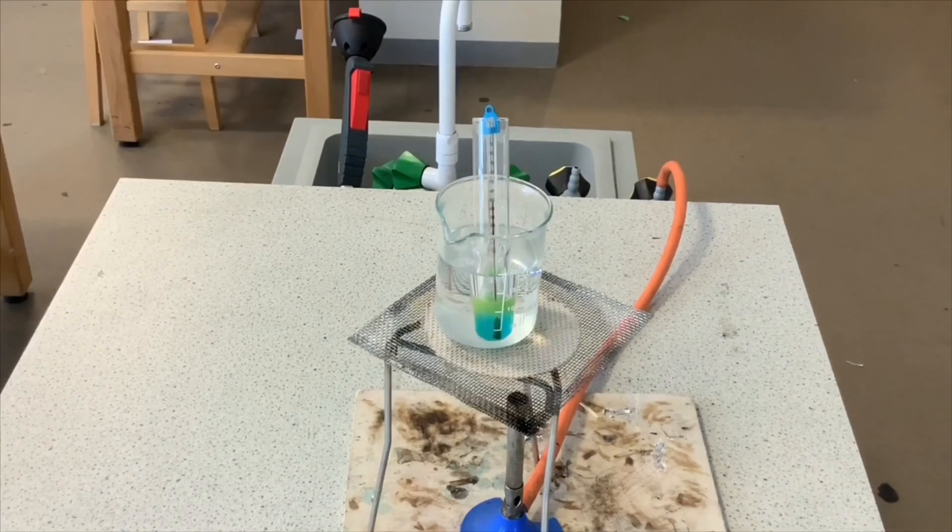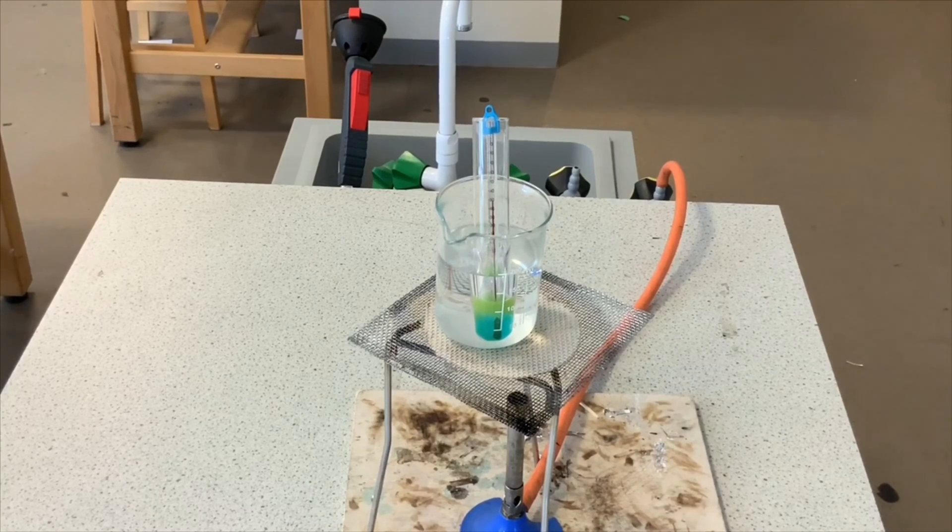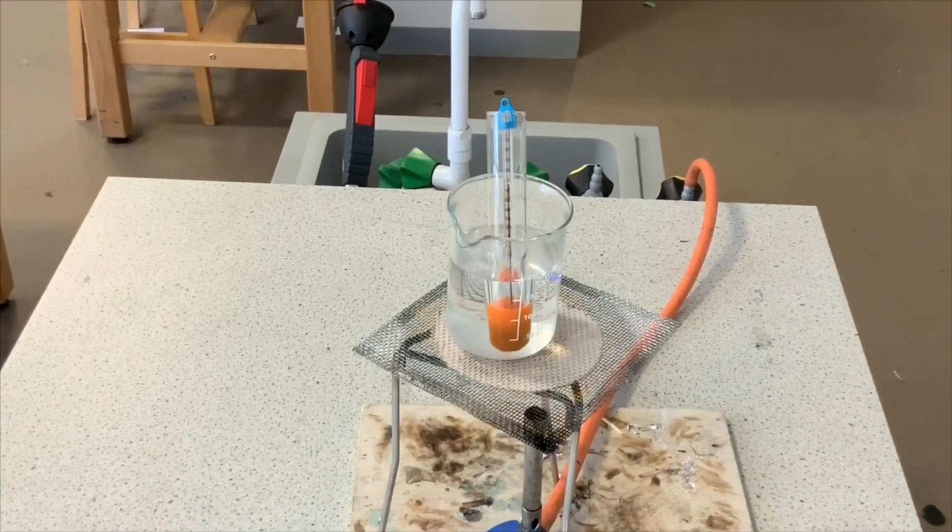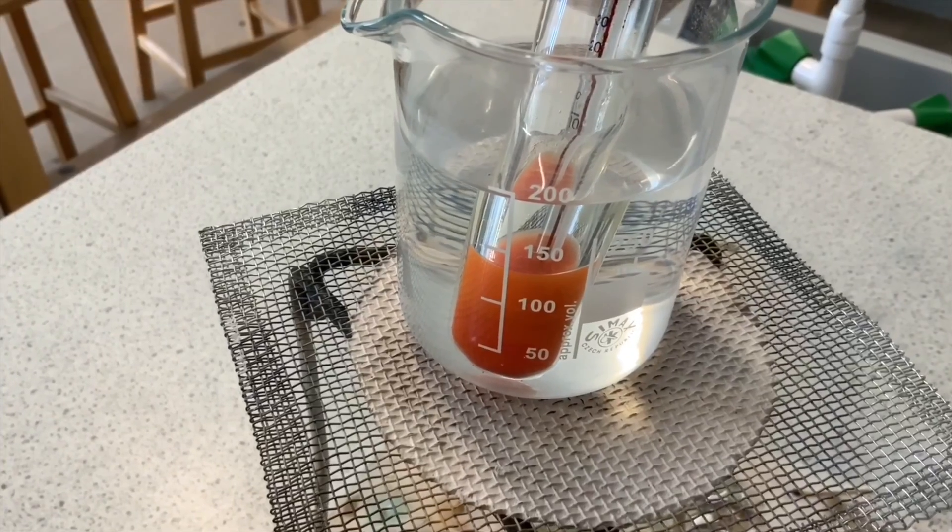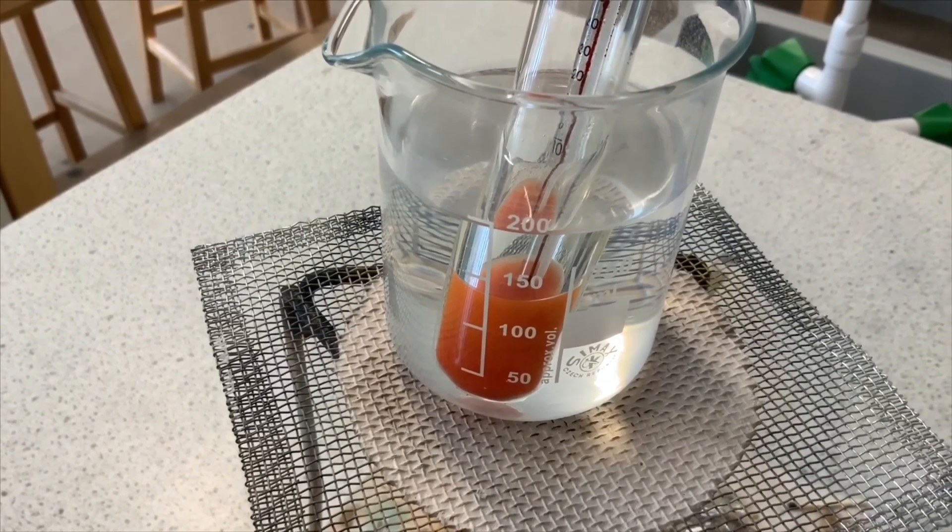If we leave it for a bit longer and that green layer starts to change, so it goes to like an orangey color, that means there's a moderate amount of sugar actually there. If it starts to go more of a brick red color, and you can see it changing here in my video, that means there's actually quite a lot of sugar present.